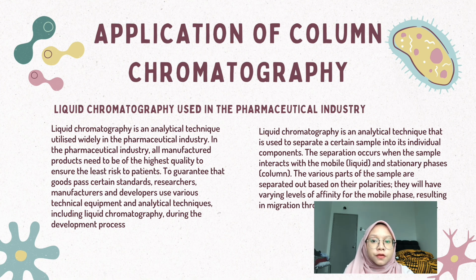In this video, I will explain the application of column chromatography in the pharmaceutical industry. So before we move to the application, we have to know what is liquid chromatography. Liquid chromatography is an analytical technique utilized widely in the pharmaceutical industry.